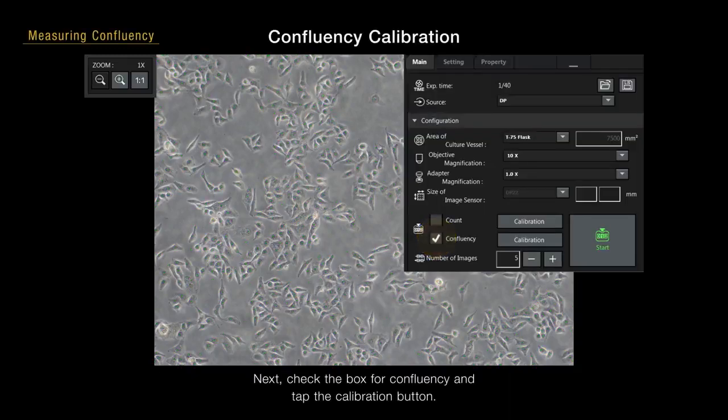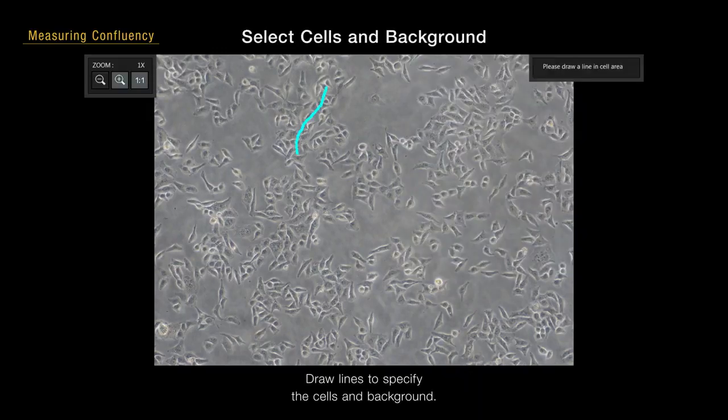Next, check the box for confluency and tap the calibration button. Draw lines to specify the cells and background.